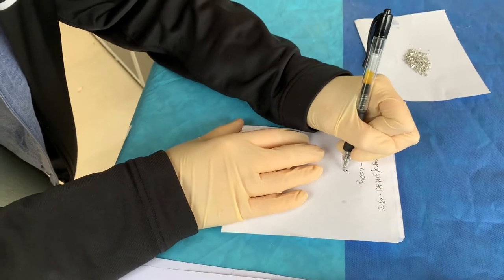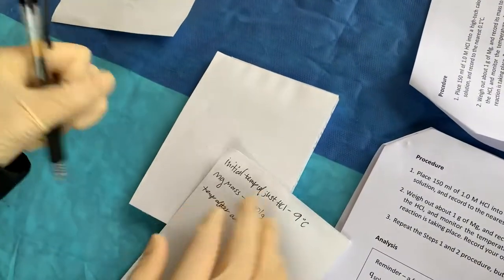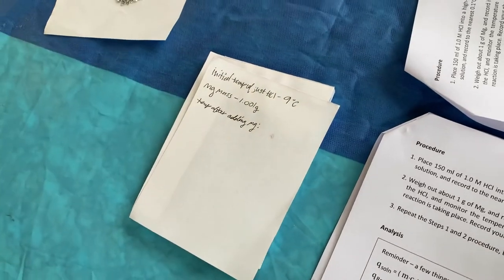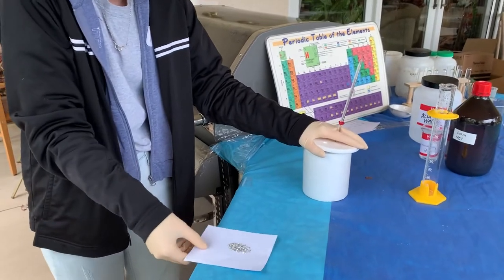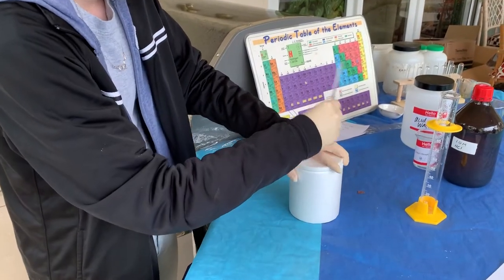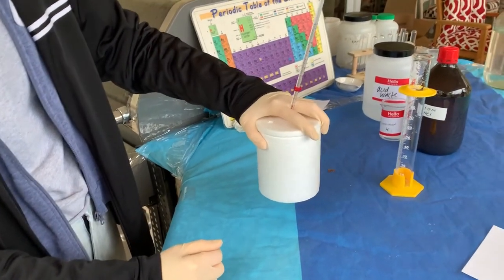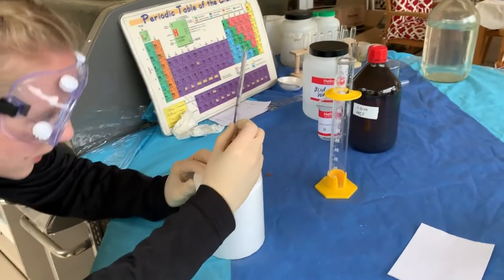After adding magnesium, I can just write the temperatures down and list them out. Now Claire is going to add the 1 gram of magnesium into the hydrochloric acid. She's going to stir and we're going to record the temperature immediately after putting in the magnesium.